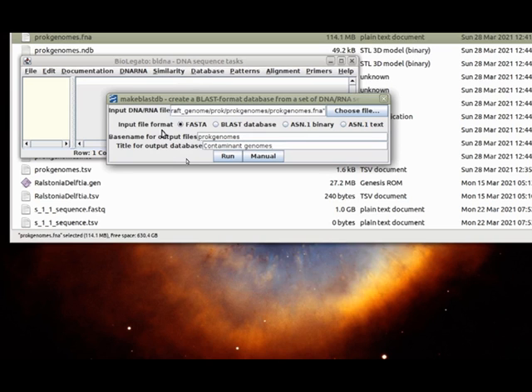The reason is that many algae have bacterial symbionts that the DNA will co-purify with the algal DNA, and so when you sequence the genome you get both. So one thing you might want to do is to see if you could eliminate the reads from the original set of reads, so eliminate the prokaryotic sequences.